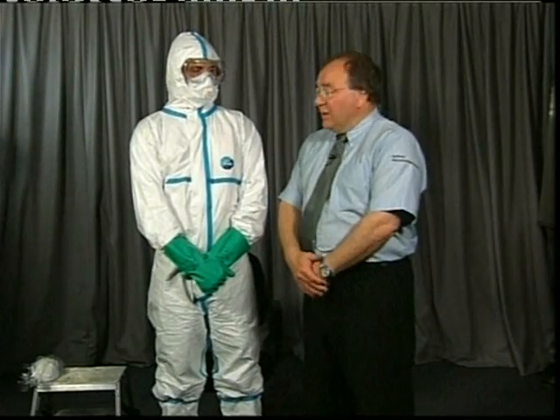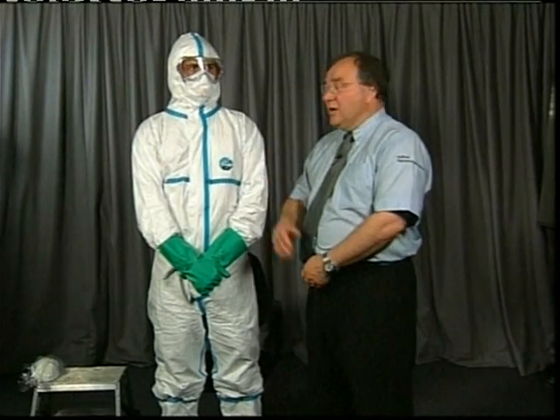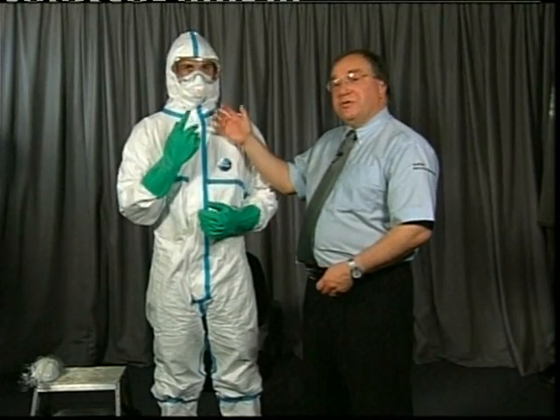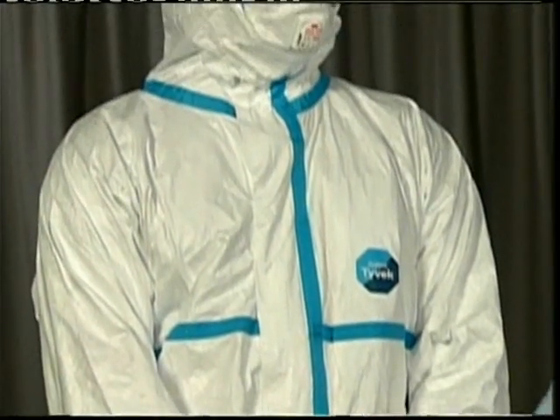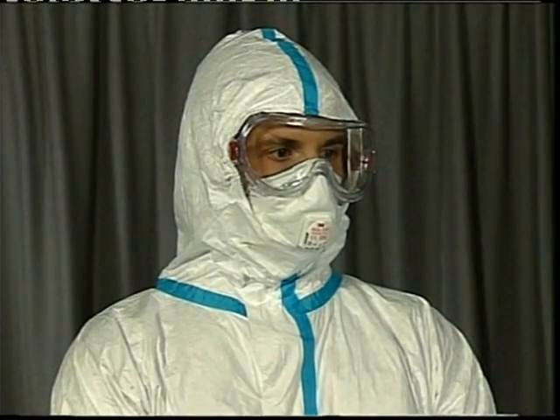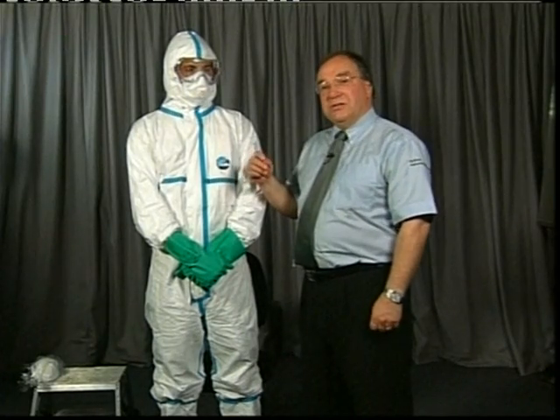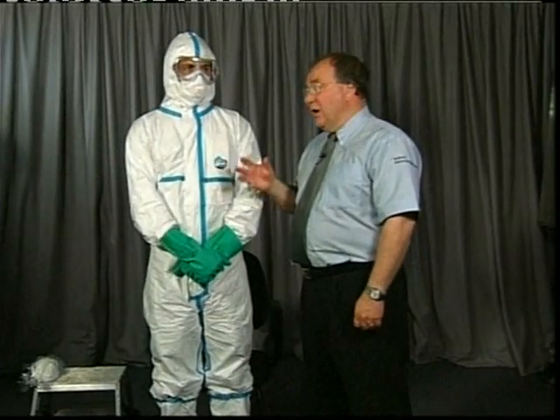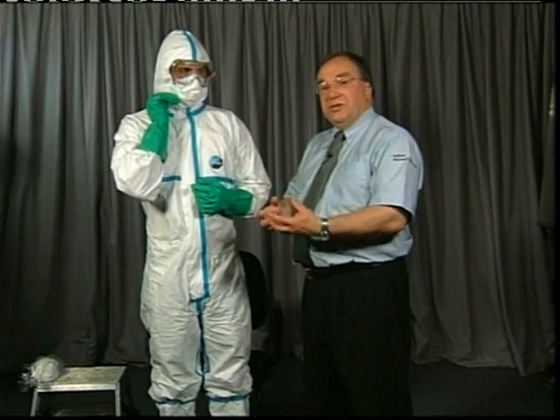Once you've come back from the environment of probable hazard, you then have to undress. Undressing is actually more important than dressing, because you now potentially have contamination on the suit, on the gloves, or on your respirator — a microclimate of the hazardous environment. You have to take the garment off safely so you don't contaminate yourself. The aim is to peel it off like a banana, turning it inside out, so the clean inside becomes the outside and contamination is contained within the suit.